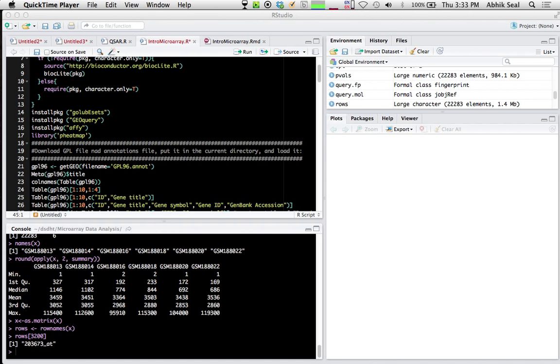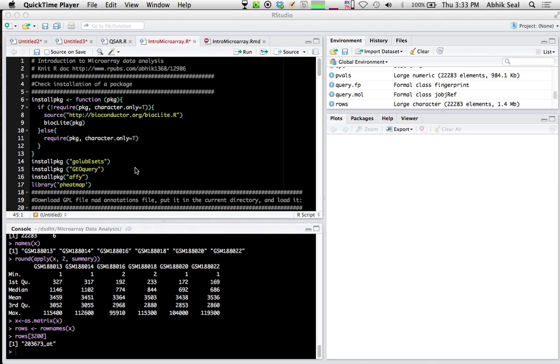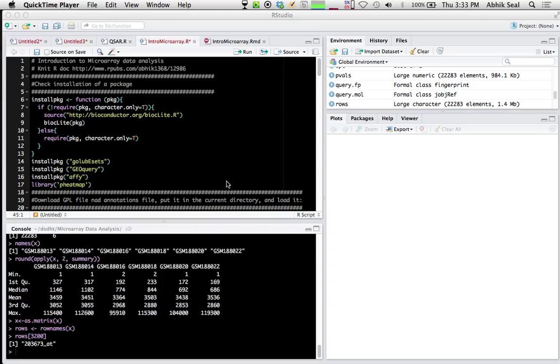In this exercise we'll see how dioxin changes the expression of different genes with respect to controls - which genes are upregulated or expressing more, and which genes are going down.